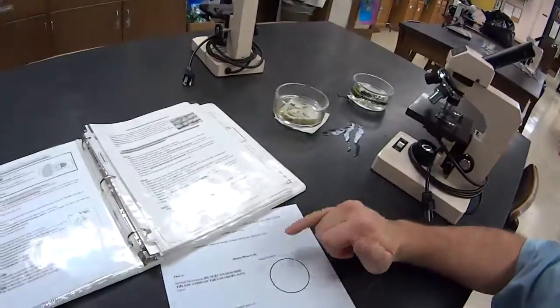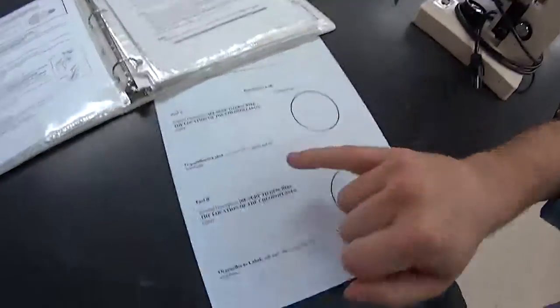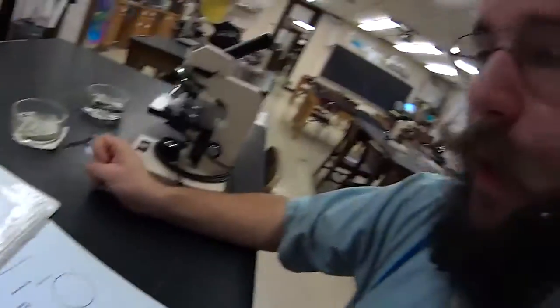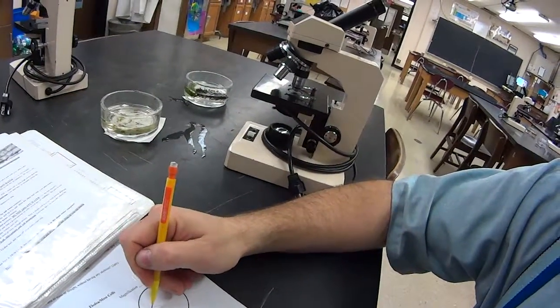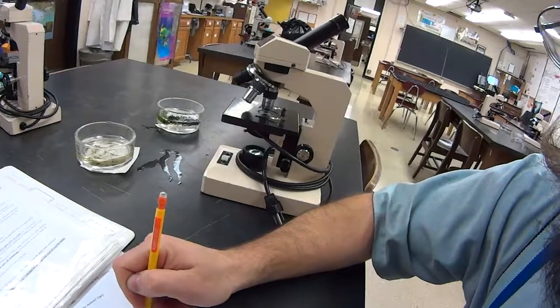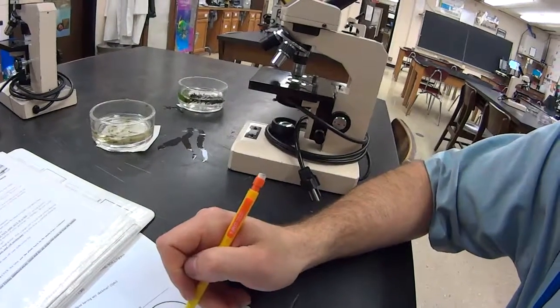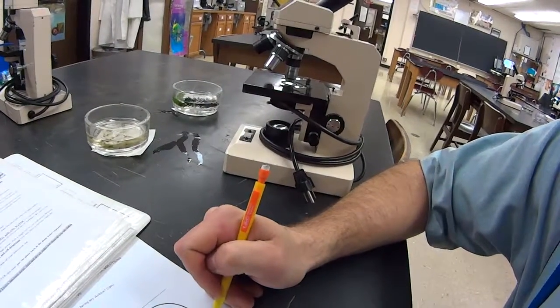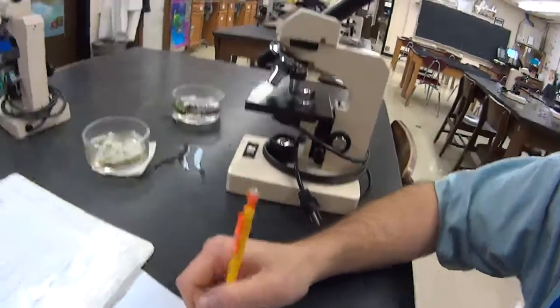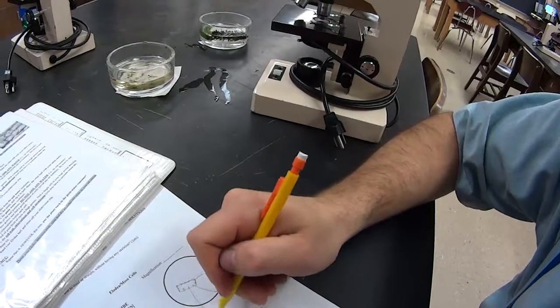The only sketch you need to make here is at 400 times magnification. Notice there's only the one circle, so you're just going to do the 400 times. You've got to label those organelles. You'll know where the cell membrane is because it'll be pushed really close to the cell wall. So if you have your cell, one of them is going to fill the whole area, but one of them looks like this where you just see chloroplasts all around the outside. The cell membrane then is right here, right up against the cell wall. So you'd label cell wall and label cell membrane just on the inside of it, and then obviously the green things — those will be your chloroplasts.